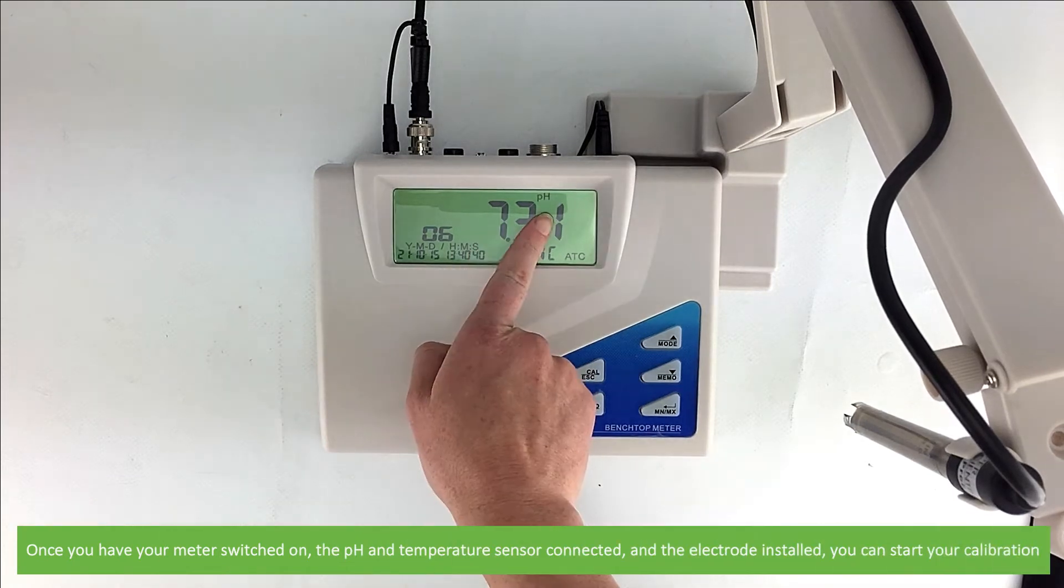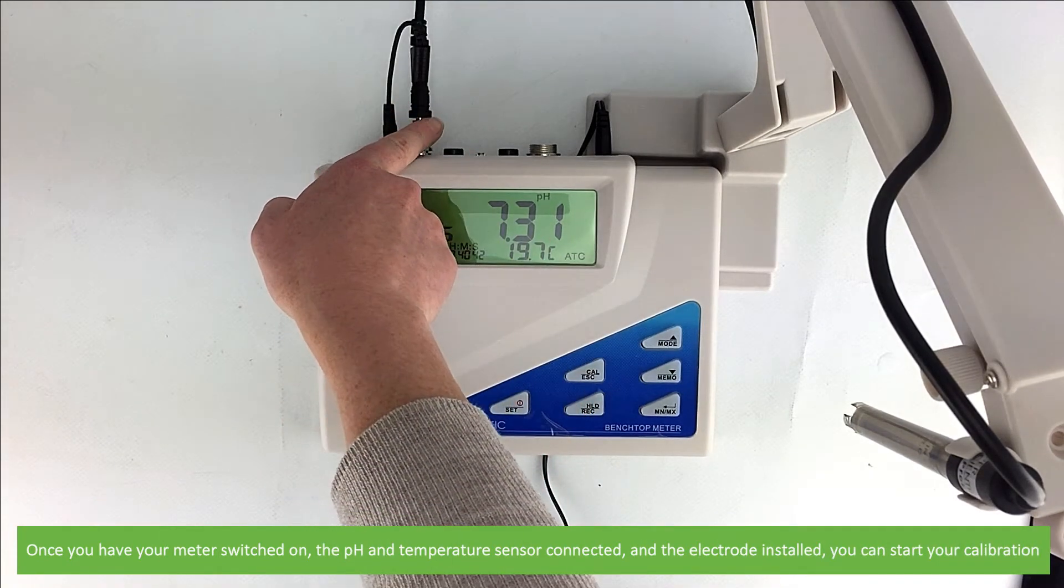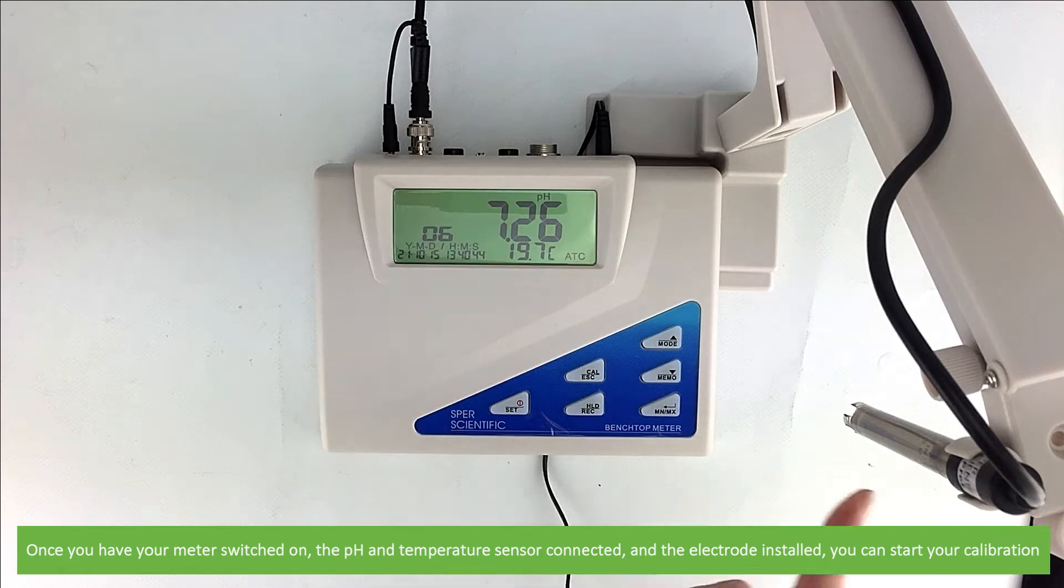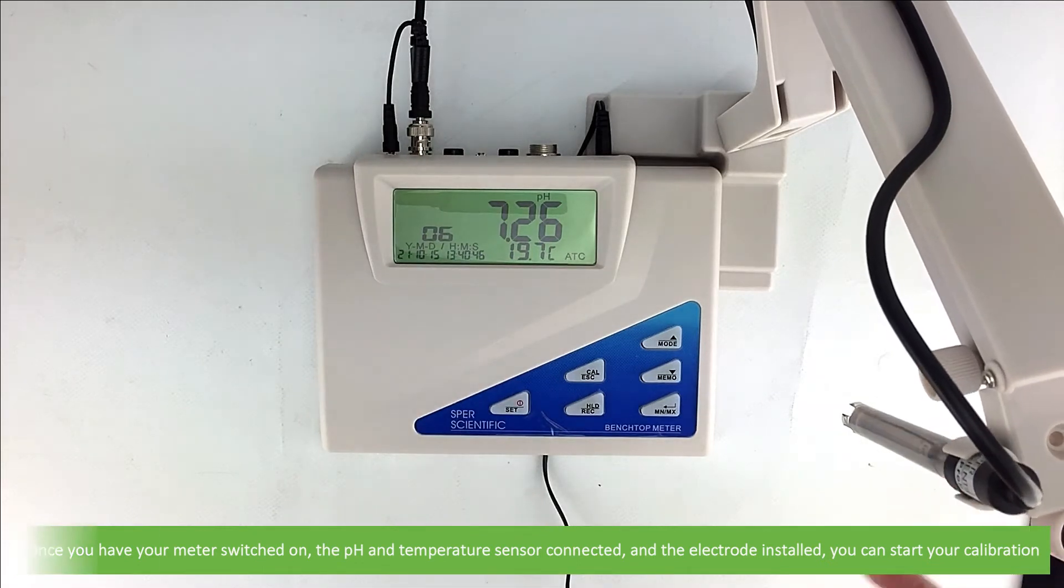Once you have your pH meter switched on, the pH and temperature sensor connected, and the electrode holder arm installed, you can start your calibration.